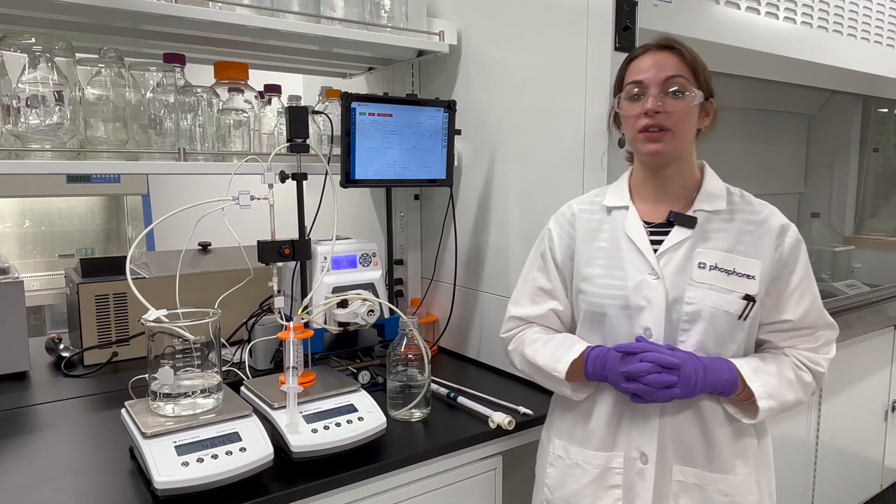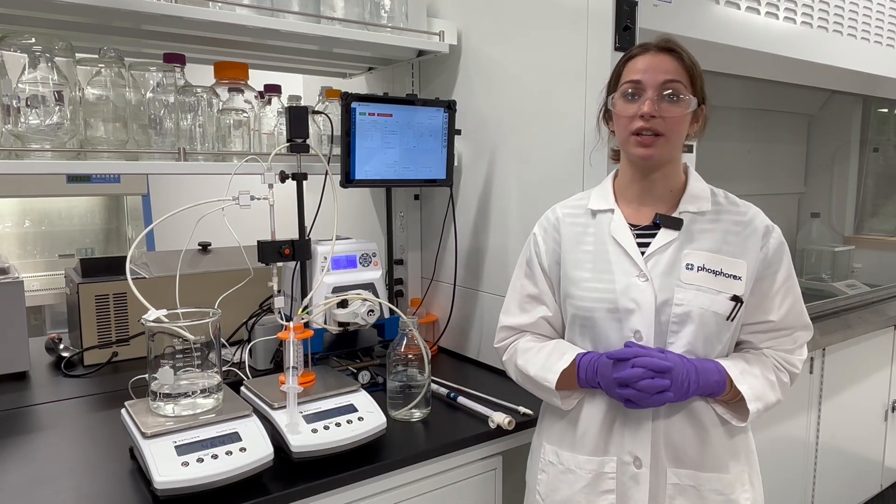This is also important because it may not be feasible to linearly scale column surface area with the batch size.